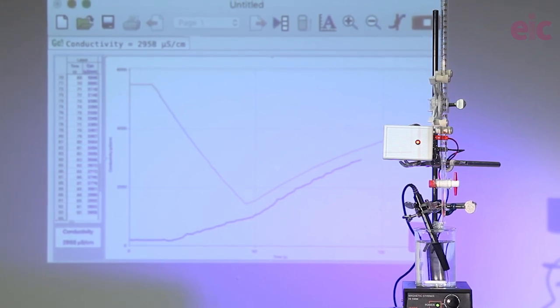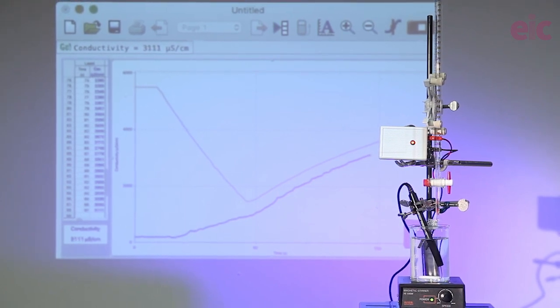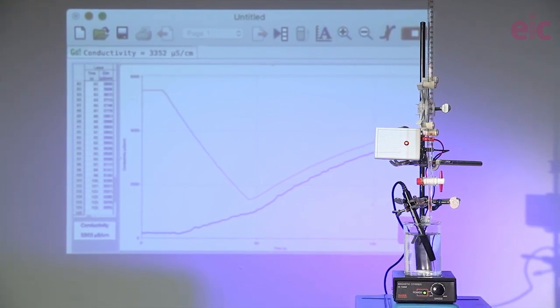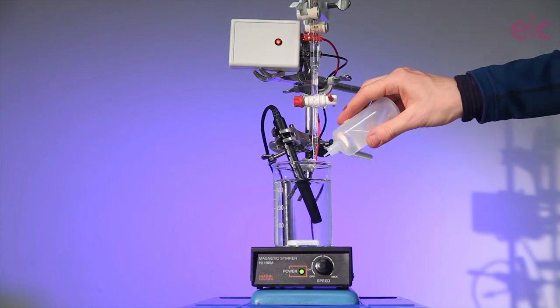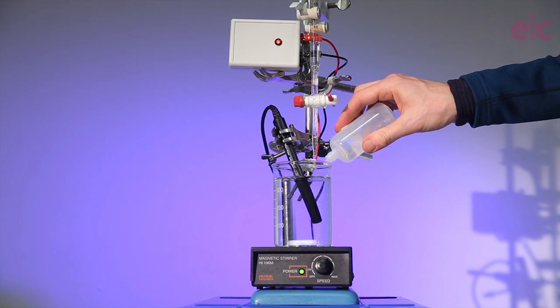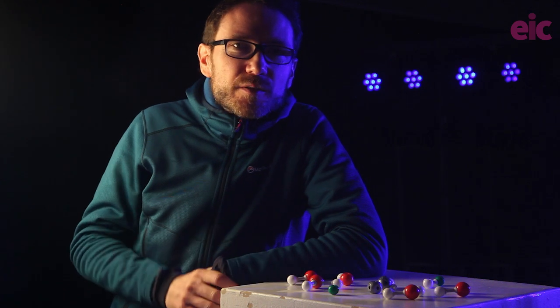There's a weird cognitive trap waiting that I might suggest you probe with your students if doing this. What do you think is going to happen to the conductivity of the solution now if we add some more acid to it, neutralizing the excess sodium hydroxide? Let's give it a try with the undiluted ethanoic acid. Your gut instinct and that of your students might be to think, well, the conductivity will go down again. But of course, all we're doing is making more ions. The conductivity is going to continue, in fact, to rise, just not as steeply as it did before.